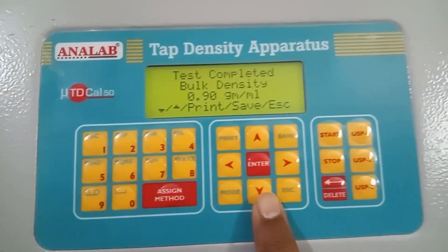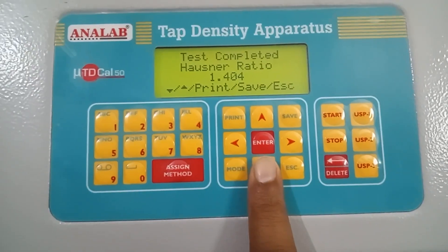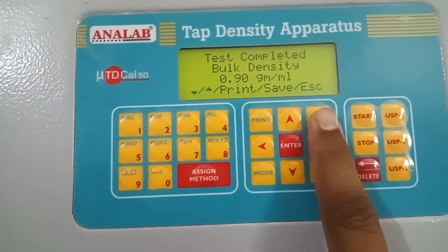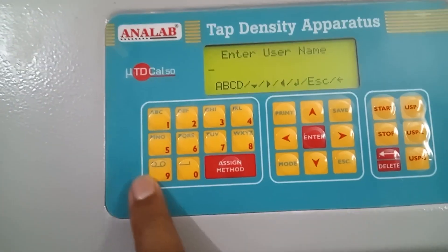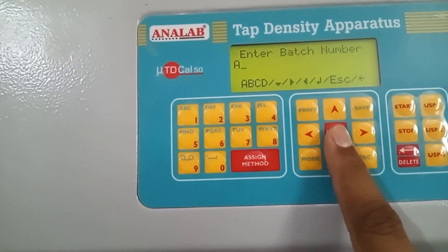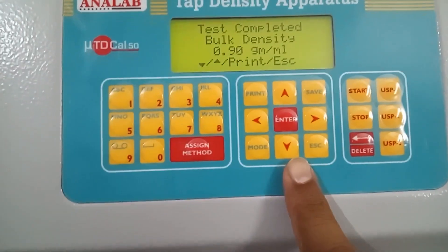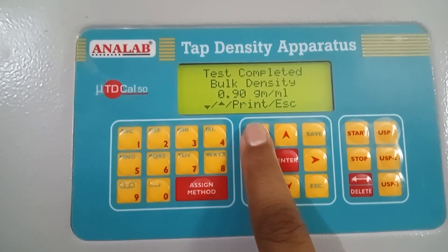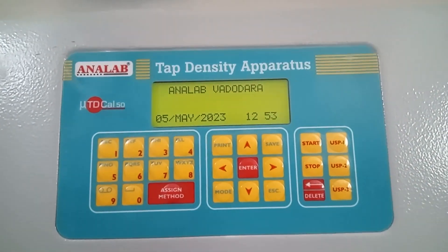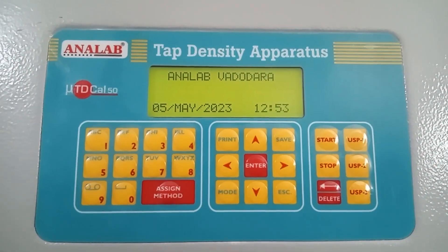So these are the results. This shows bulk density measured in grams per ml. Tap density is also shown here, along with Hausner ratio, compressibility, and bulk density — these are the options which are available. If you want to see the data, then we can press enter. We need to enter the user name — right now I will write an arbitrary number, which can be alphanumeric. Once I press enter, the result will be saved and it will also show the record number. So all this data has been saved. If you have a printer attached, then you can directly print by clicking here. Or if you want to quit the analysis, you can press escape. The instrument will return back to the home screen. This is how the analysis is done in the TDKL50 model of tap density apparatus.